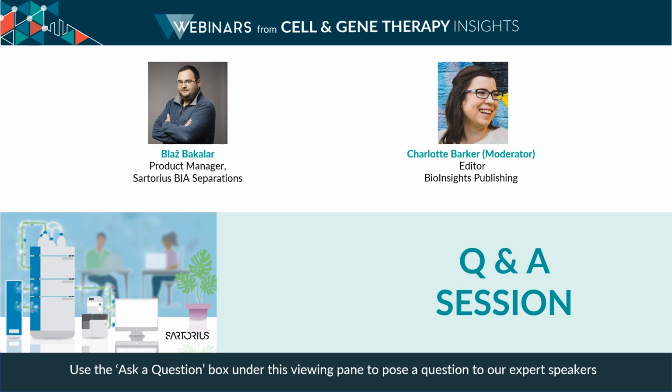Thank you. What was the scale of the fed batch production experiment? Oh, the one that I showed where we used AMBER and PATfix together, the volume of the bioreactor was 250 milliliters. We started at, I think, around 150 milliliters. And then as we fed additional nucleotides in, I think we reached over 200 at the end. A milliliter scale. And that would put our final yield at over 2 grams of mRNA synthesized this way.